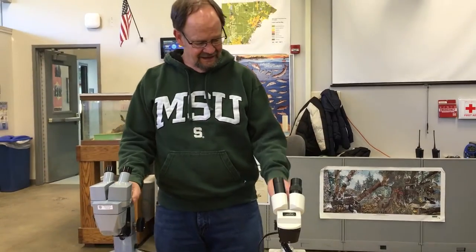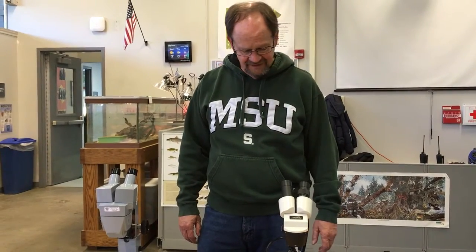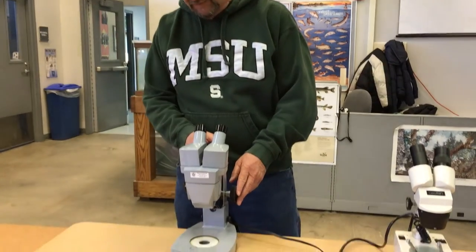Hello, my name is Tom Green and I'm going to spend a few minutes today looking at the dissecting microscopes that we use in our field trips in the spring. We have two different types of dissecting scopes at the center and I'll go over each one, but they're basically very similar. The first one we're going to go over is this American Optics one.